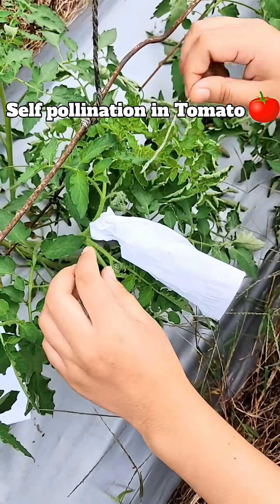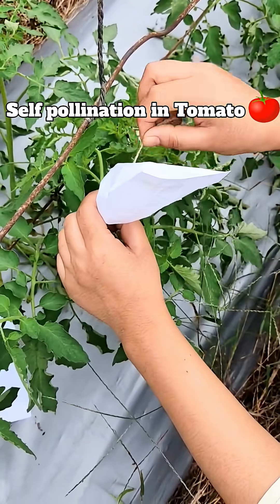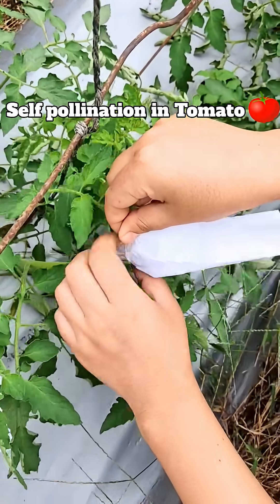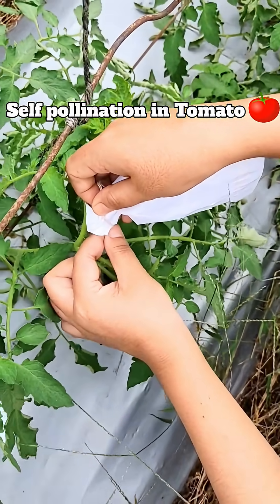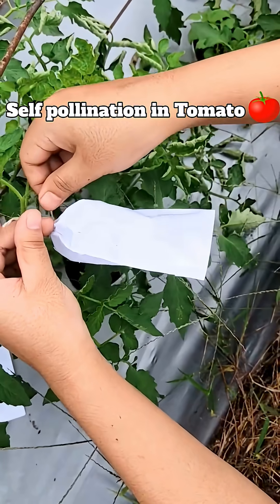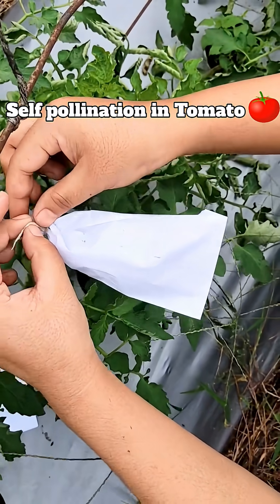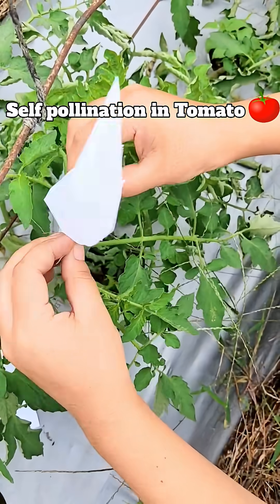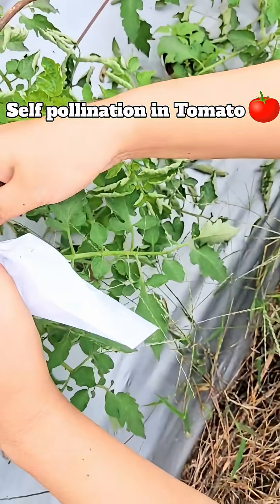Before the flower opens and the stigma becomes receptive, we cover the buds with bags. A question may arise: tomato is itself a self-pollinated crop, so why do we need to bag it? The answer is nothing is 100% — though it is a self-pollinated crop, we cannot guarantee 100% self-pollination. There will always be some percentage of outcrossing, or cross-pollination. Since this is a research plot, we need to bag the flowers to ensure 100% genetic purity and confirm the fruit obtained is truly self-pollinated.